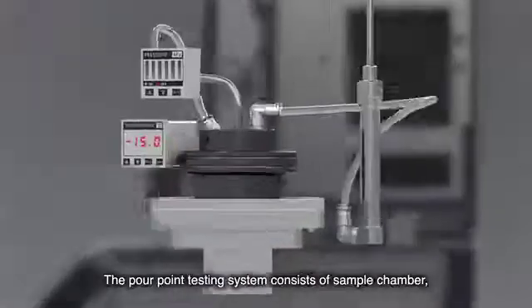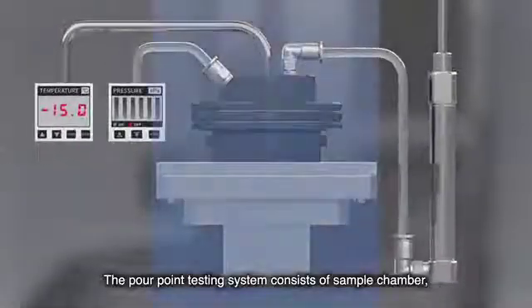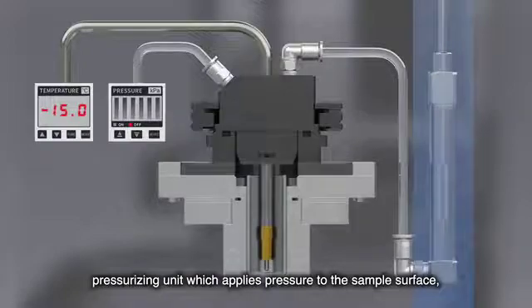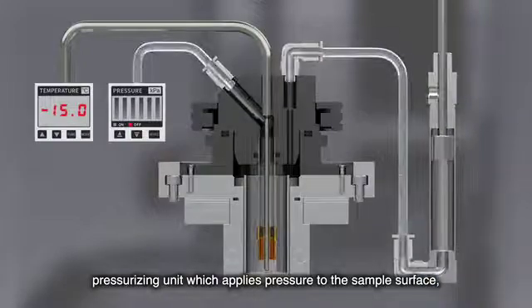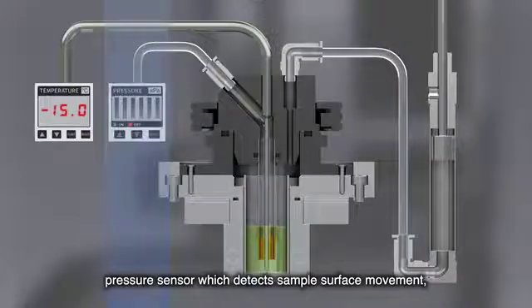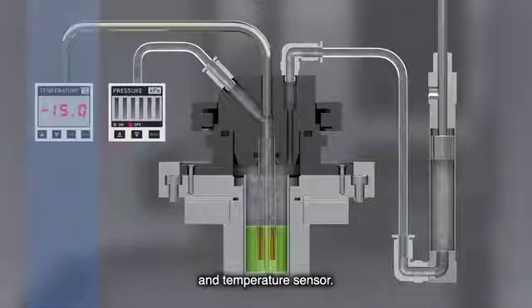The pour point testing system consists of sample chamber, pressurizing unit which applies pressure to the sample surface, pressure sensor which detects the sample surface movement, and temperature sensor.